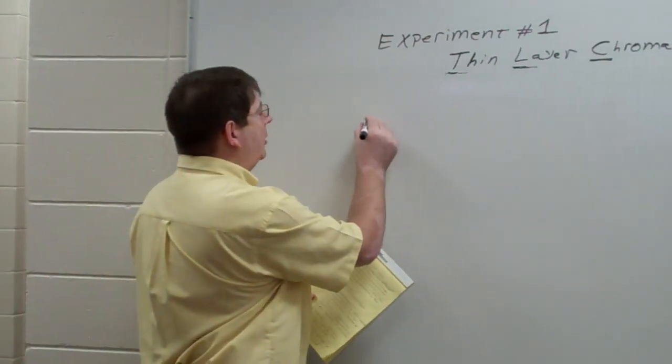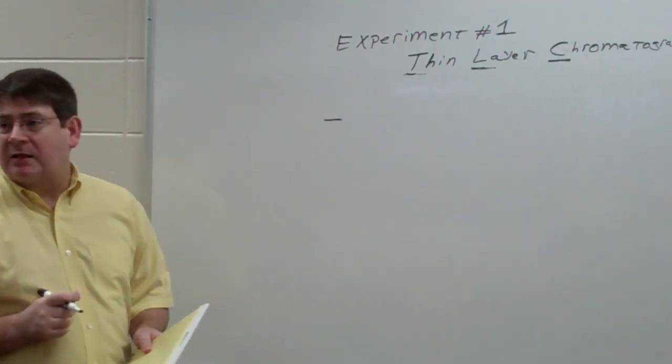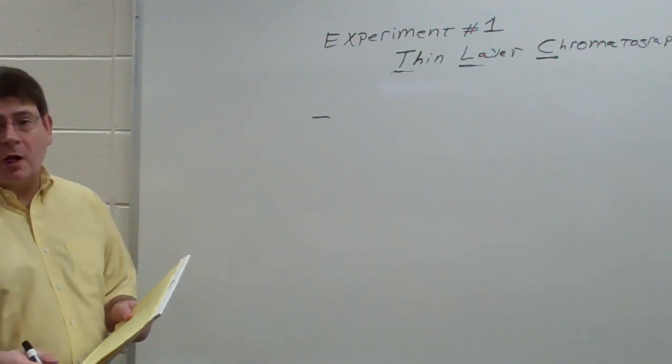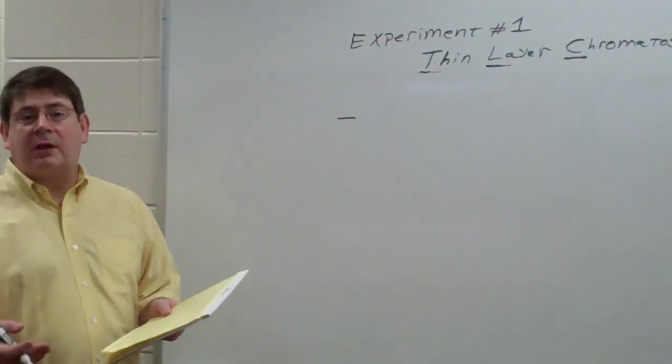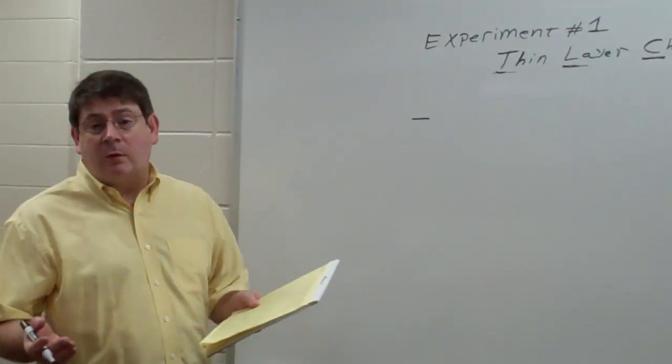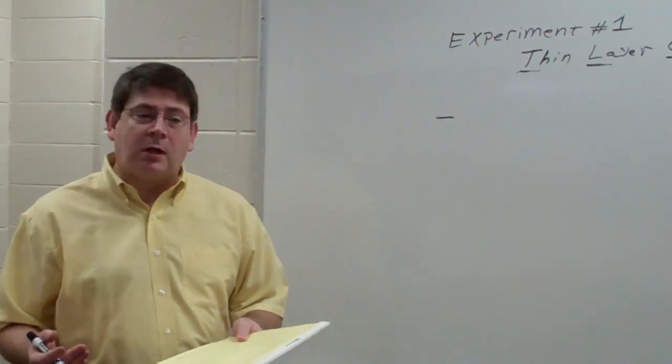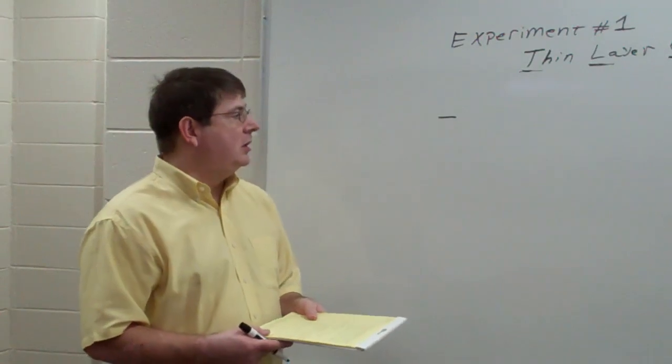However, it has a more broader definition today. Today it's used to separate any mixture, complex mixture. So if you have a mixture that contains 2 or 3 organic compounds or even more, you can actually separate them using chromatography. And today we're going to talk about the special technique known as thin layer chromatography.